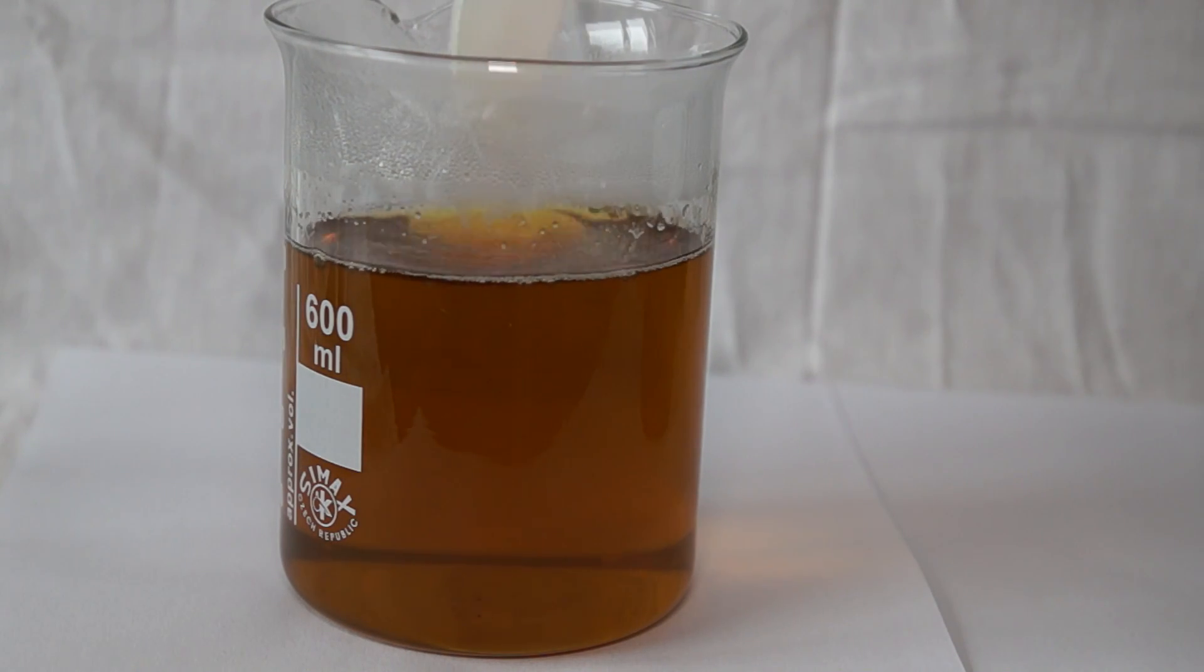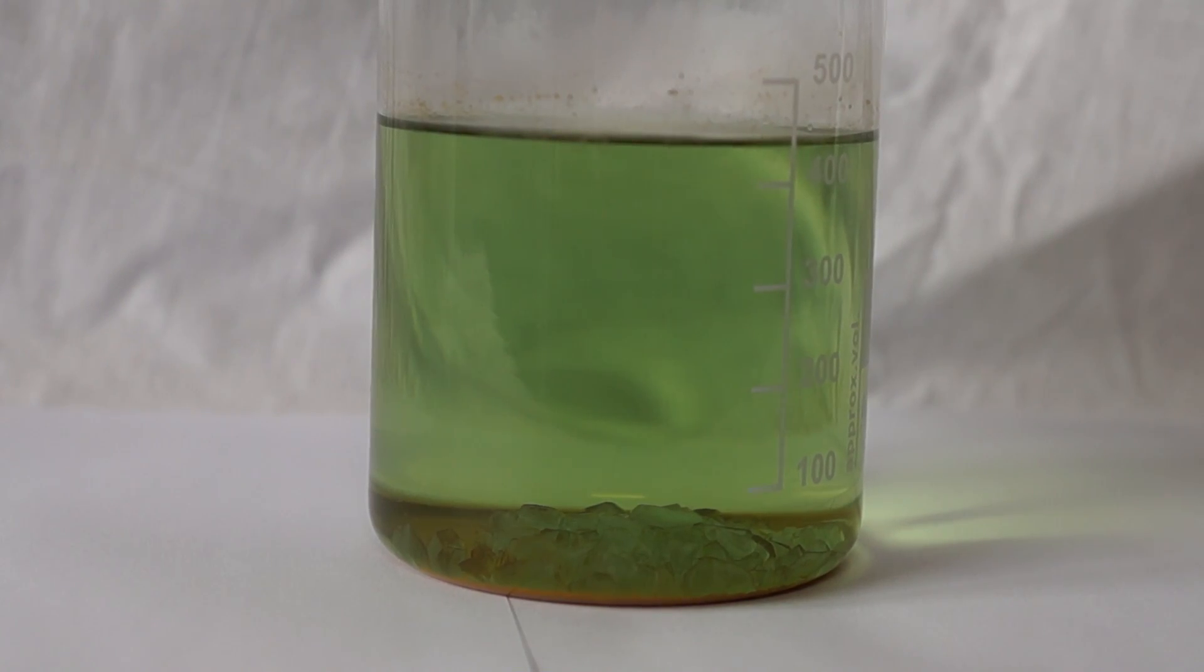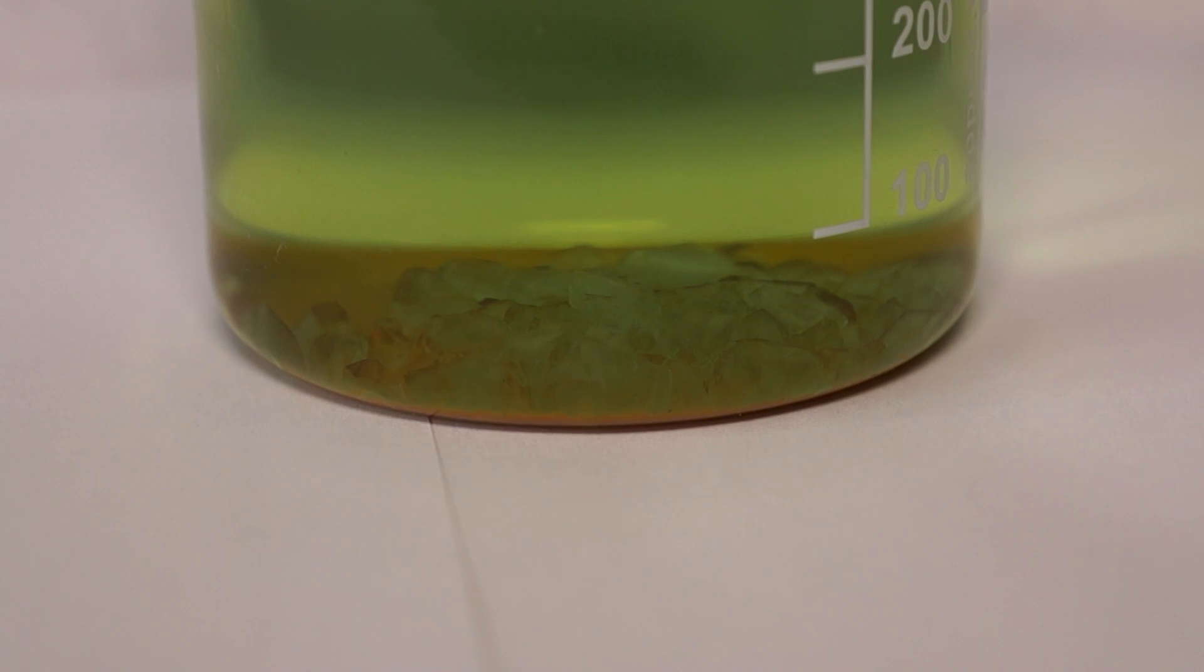A day later we can see that a lot of small green crystals of Mohr's salt have grown on the bottom of the glass. Also, we don't need the iron oxide precipitate that is on the bottom of the glass.